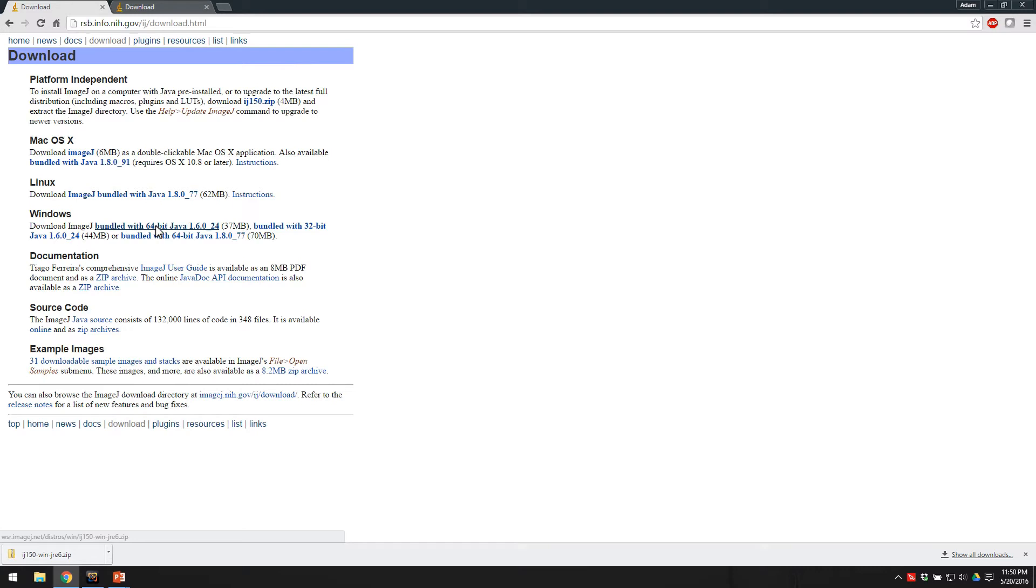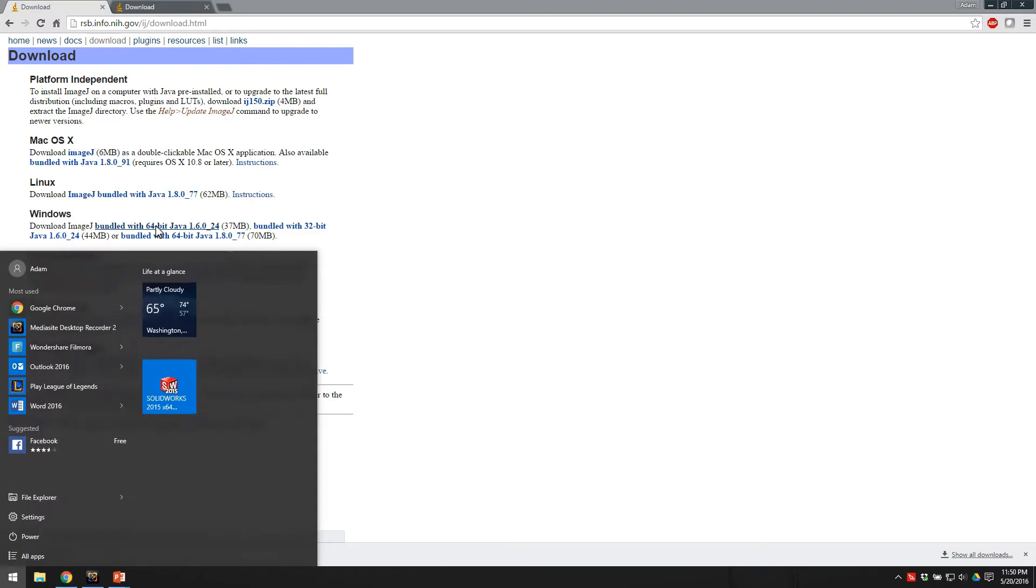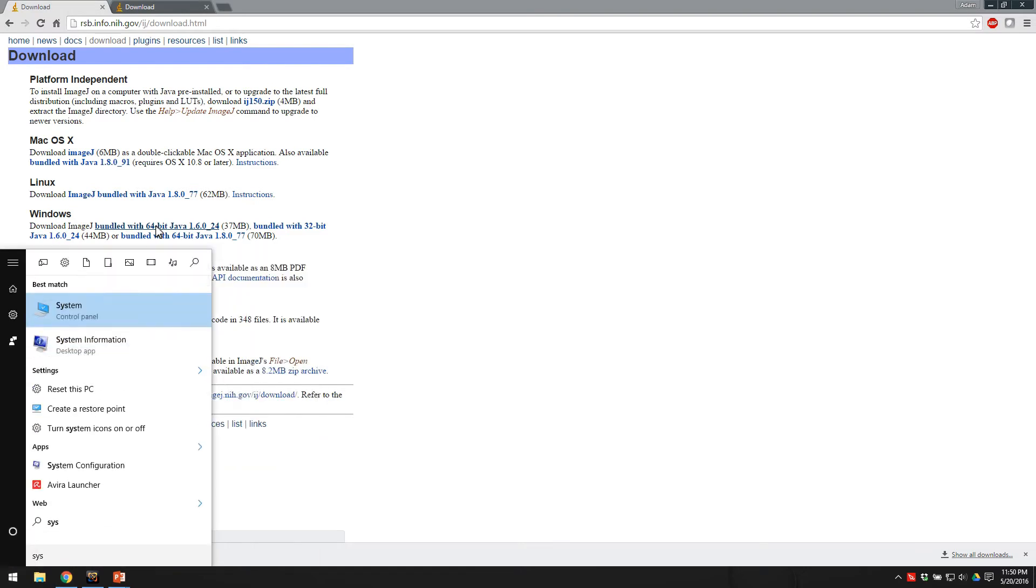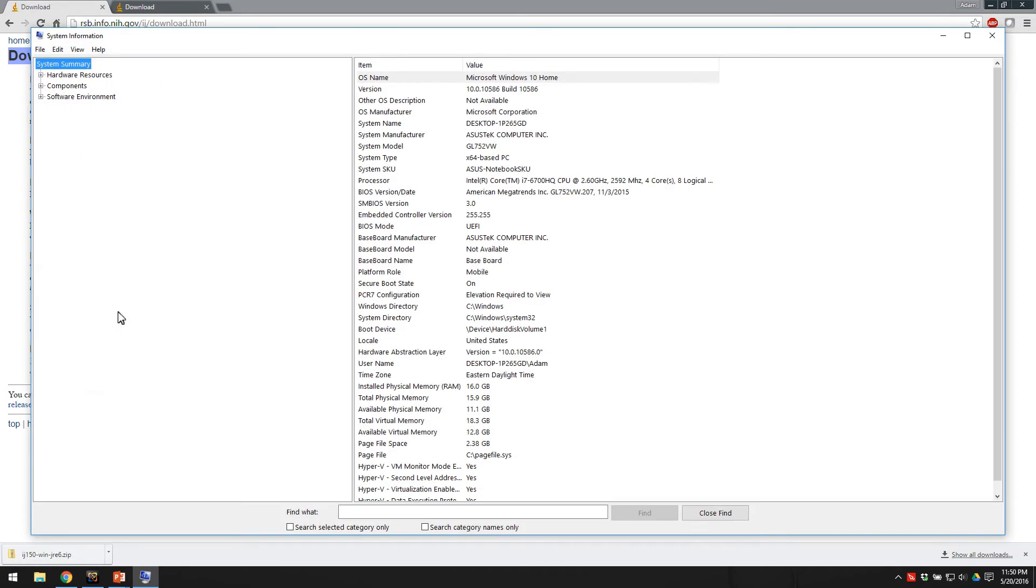If you're not sure what bit operating system you have, you can just hit the Windows key on your keyboard and type in system, and get your system information, and you'll see a 64-based PC. It is right here.